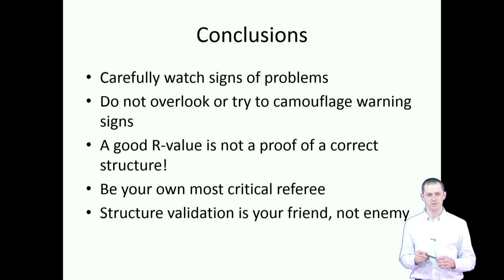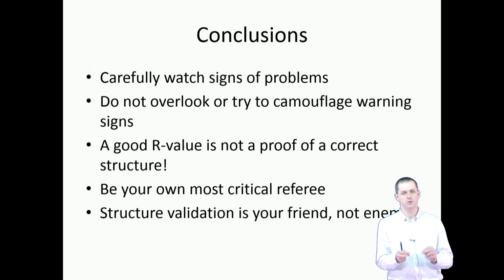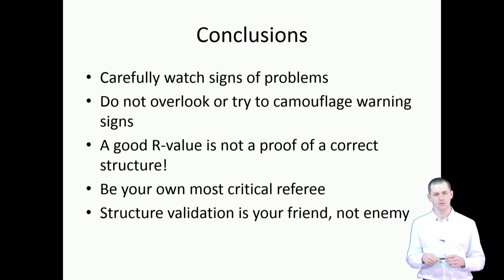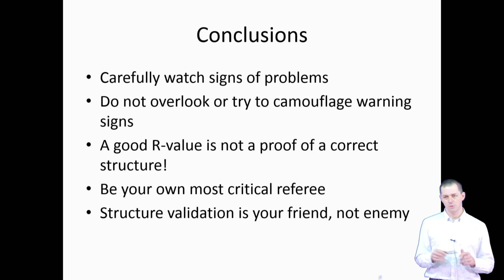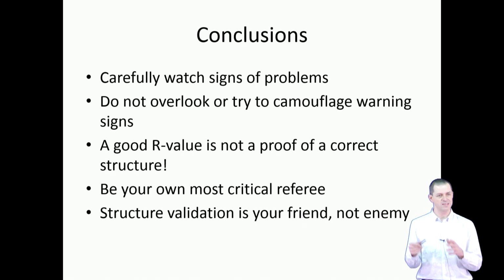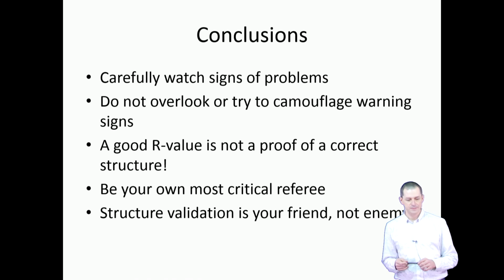but you can still make a mistake with this. You may miss small hints of small features in the structure that you do not recognize in the final solution, like weak superstructure reflections or modulation. So you are happy with the result, but the result may still be wrong, or at least not as right as it could be if you did everything right.